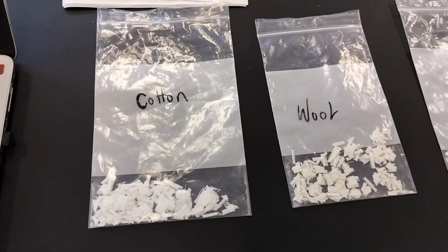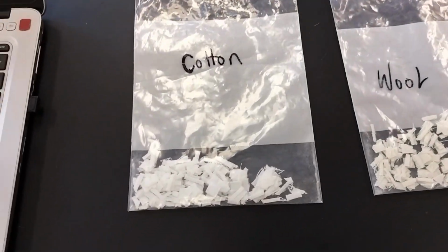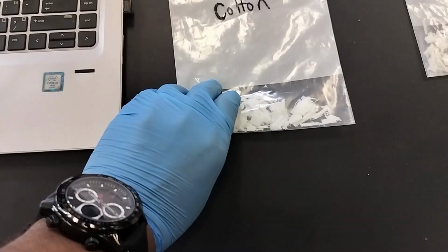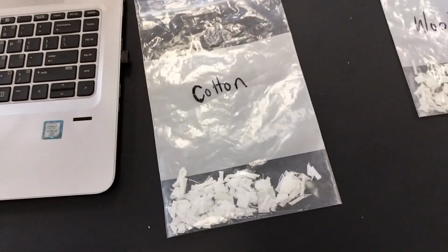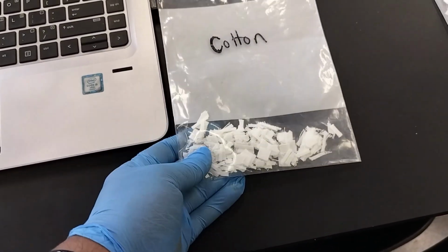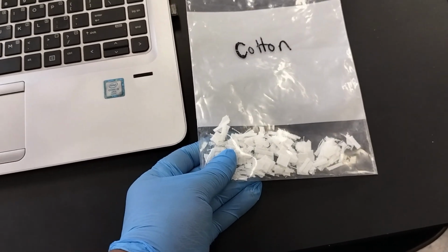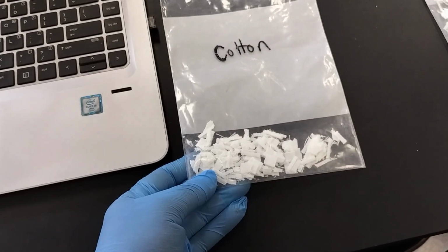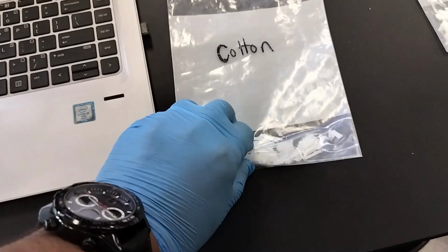Now, we are going to test our fibers one by one. Suppose that after visual inspection, burning test, and microscope observation, you narrow down that the sample is cellulosic fiber such as cotton. In this case, the next step is to apply 70% concentrated sulfuric acid. If the fiber dissolves in this chemical, we can conclude that the sample is cotton.